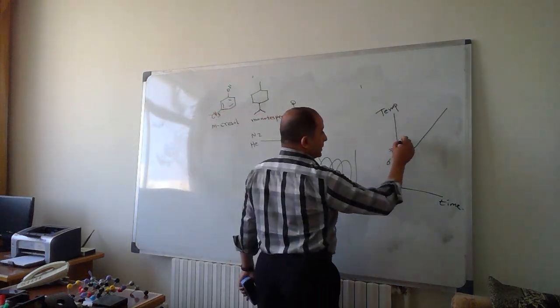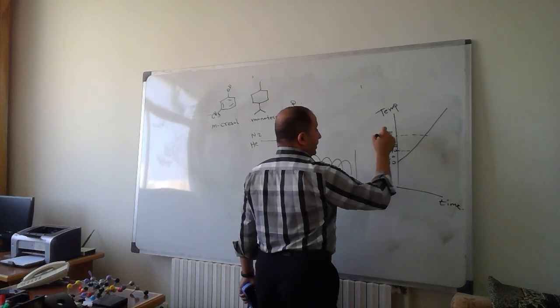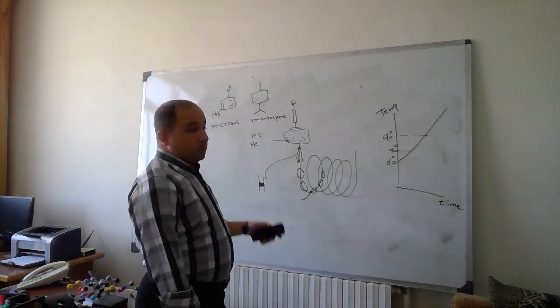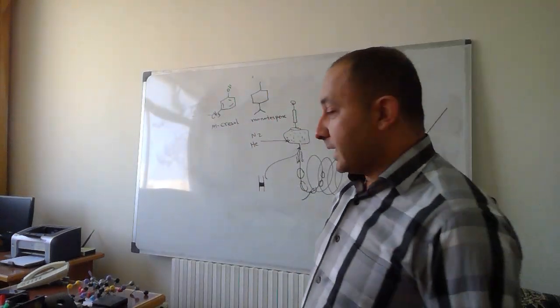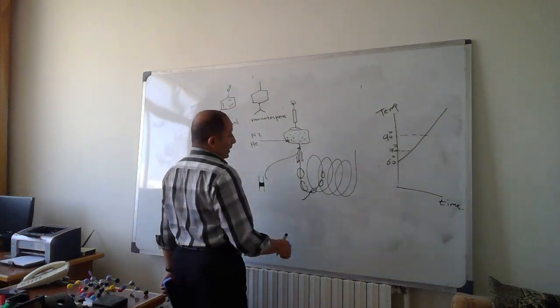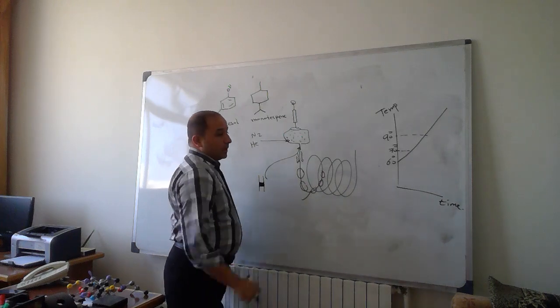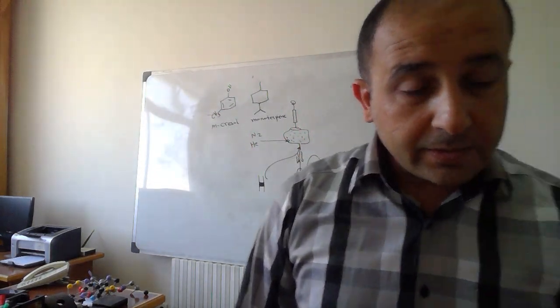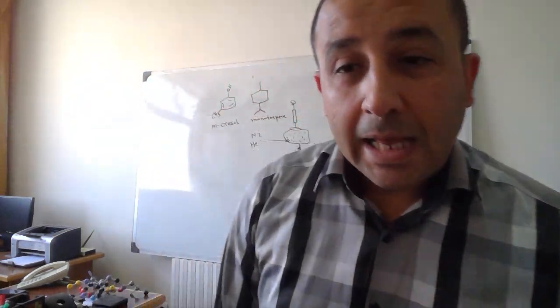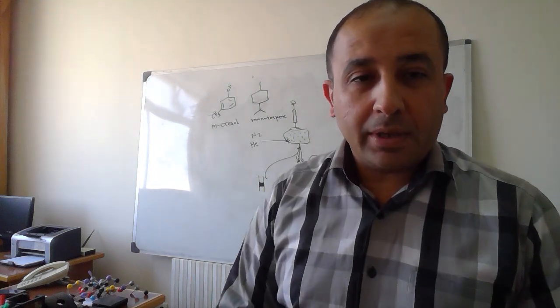Now, if we increase the temperature above, let's say, 90, metacresol will start to be converted to gaseous phase, and it will go behind monoterpene. So monoterpene will go first, then metacresol, and this separation is due to the thermal programming.